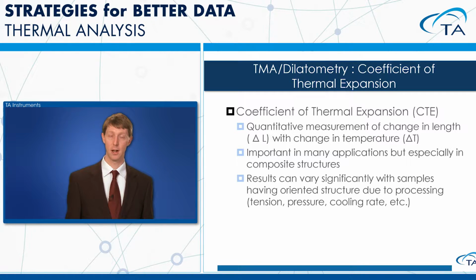Now, switching gears just slightly here, the TMA, which we haven't discussed yet in the presentation, is another tool that you're going to be able to use to look at the structure of materials and how the structure changes. The TMA looks at more of a physical, volumetric, or dimensional component of the material. So the TMA is simply going to look at how a material expands or contracts with changing temperature or changing environment. This is commonly used to look at what's called CTE, the coefficient of thermal expansion. You can look at materials in one linear direction, or you can look at the material in a couple of different facets to see the change in each direction. If there's an X, Y, and Z direction, maybe a machine direction, you can look at the CTE of that material in different directions.